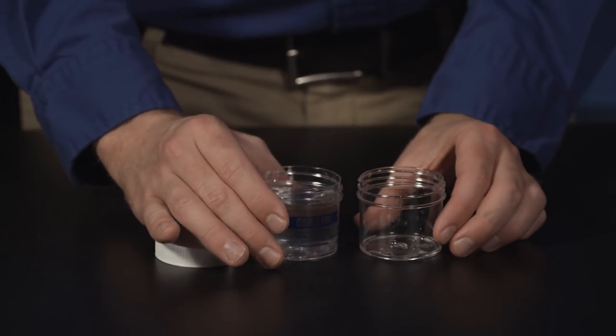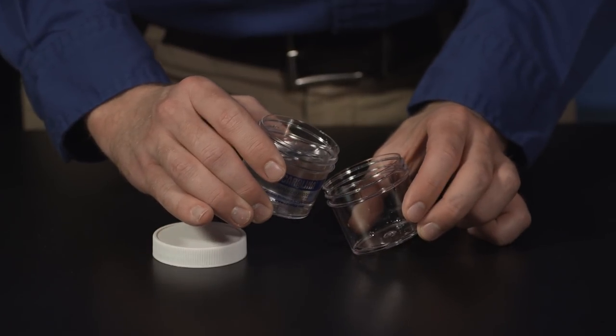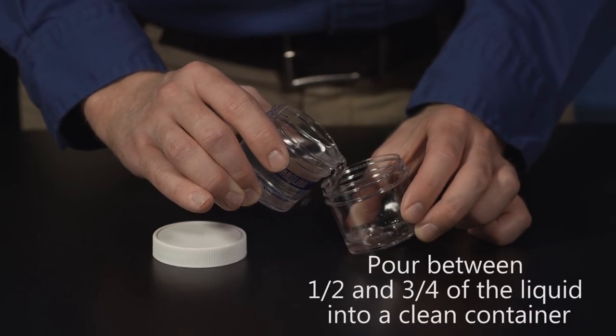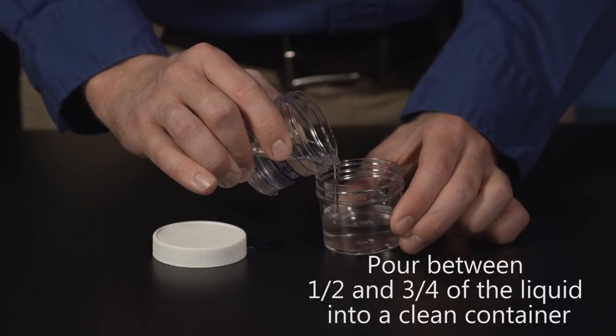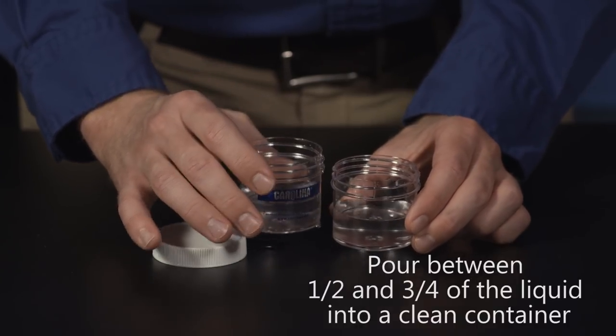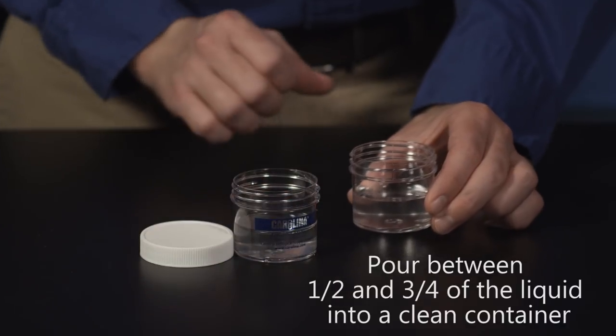After the culture has sat, pour between one-half and three-fourths of the liquid from the culture jar into another clean, detergent-free vessel. Some amoeba may be in the poured-off liquid. However, most of the amoeba will remain in the culture jar.